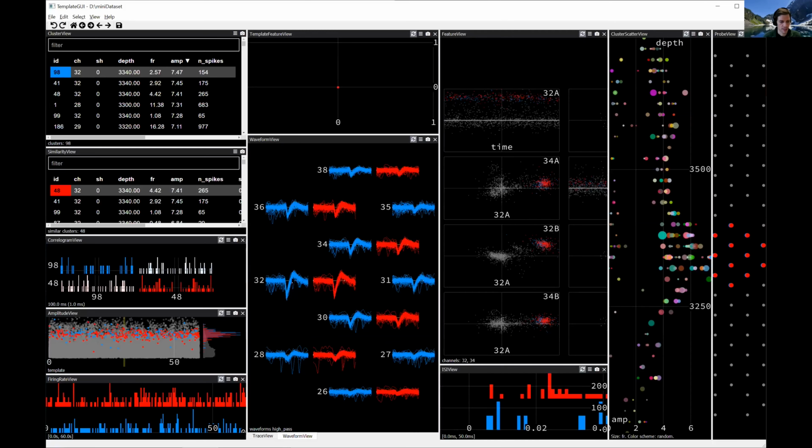given the similarity of these spikes and the weak but okay evidence from the cross-correlogram, we could conclude that these spikes actually come from the same neuron. So what we need to do is put them together in the same unit. Otherwise, each of these units will be missing some of the spikes from the other unit. And so one of the characteristics of a good unit is that it should be dissimilar to any other clusters. Right now, it's very similar to this other cluster. And so we need to merge these.